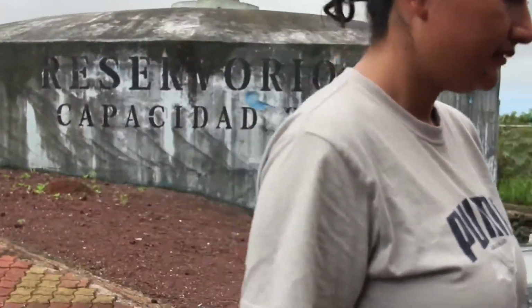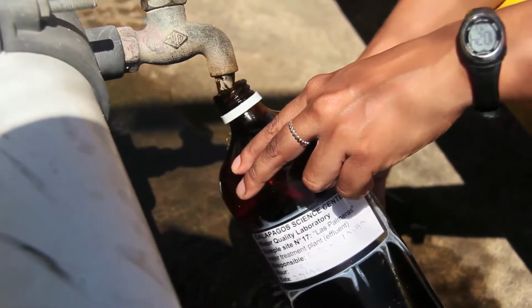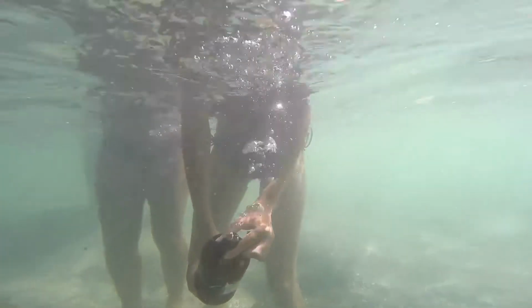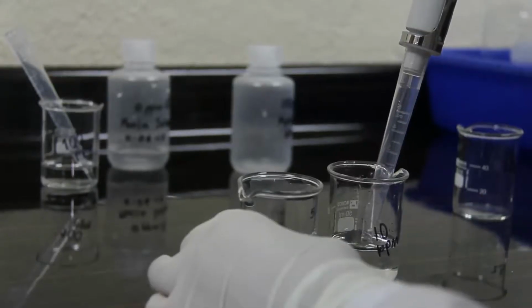Basically, we're going around town and collecting different water samples from treatment plants, different springs, and the beaches to see if there's any fecal contamination of the water. We're also doing physical and chemical tests just to see how the water quality is. Some of those physical tests include chlorides, sulfates, and residuals.